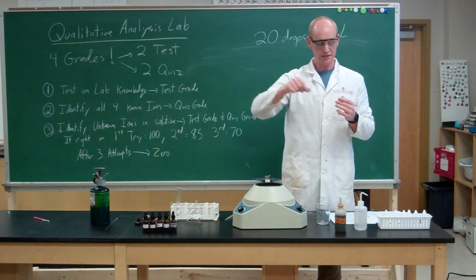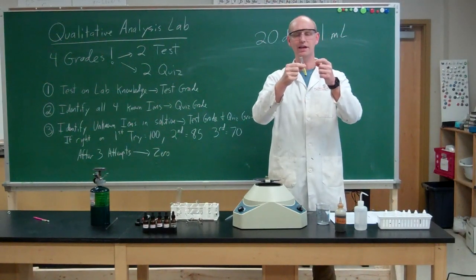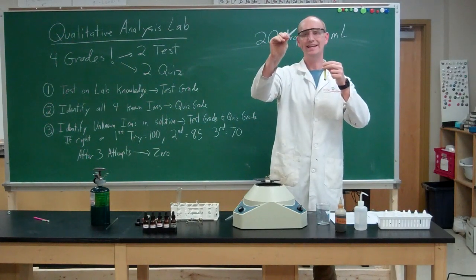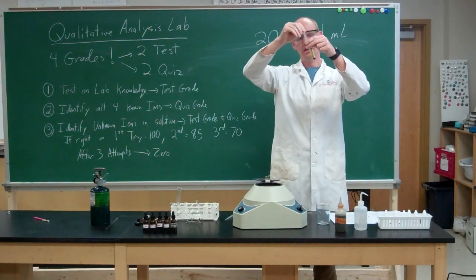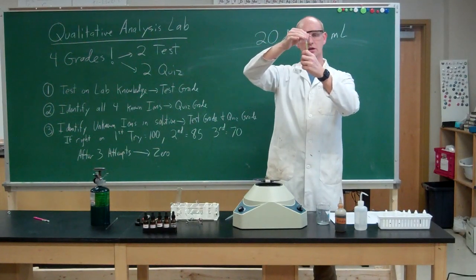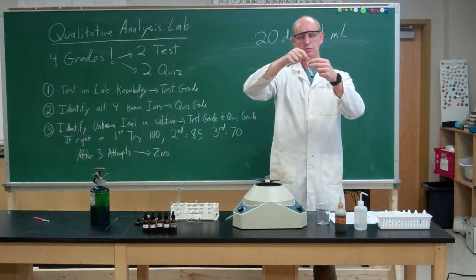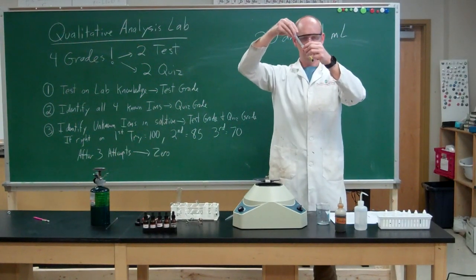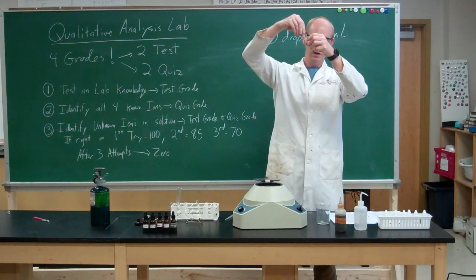So we get us another test tube, and the proper method for separating these layers is we start by squeezing our pipette. We squeeze our pipette and we put it in and we suck the liquid out and transfer it to our second test tube. And what we want to do is squeeze as close to our precipitate, the bottom, as we can.